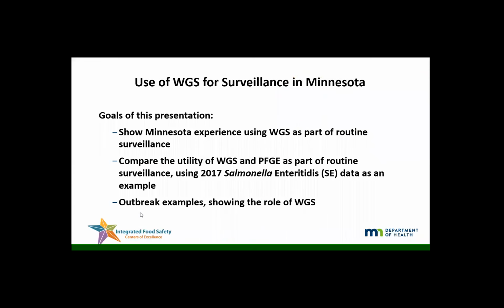All right. On this part of the webinar, I will be showing the Minnesota experience using whole genome sequencing as part of routine surveillance. I will compare the utility of whole genome sequencing and PFGE in surveillance using 2017 Salmonella Enteritidis data as an example. And I will show some outbreak examples using whole genome sequencing.